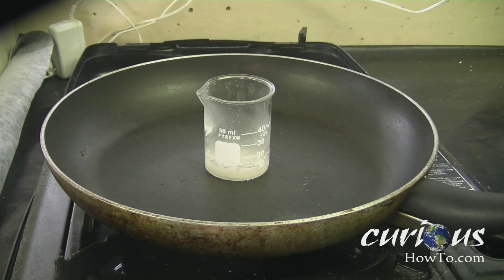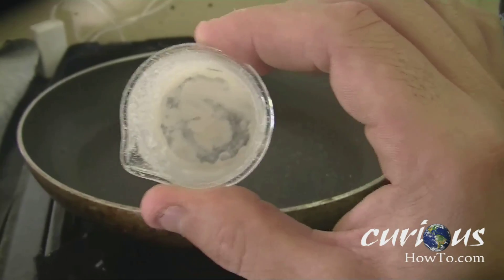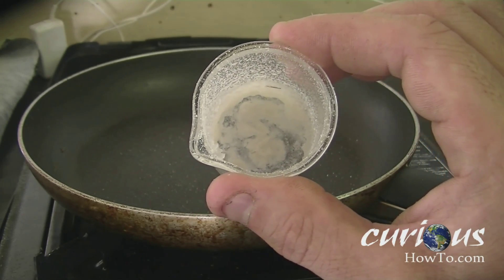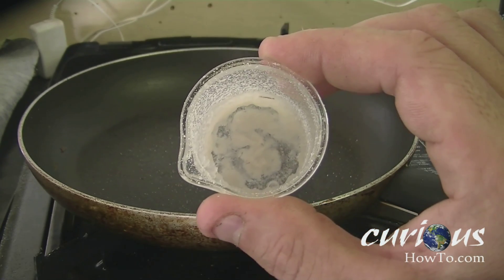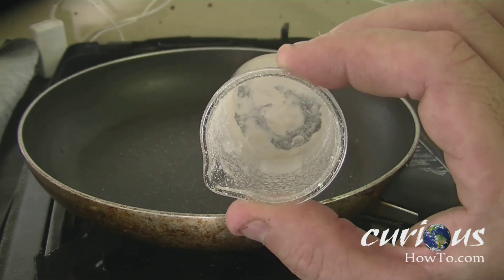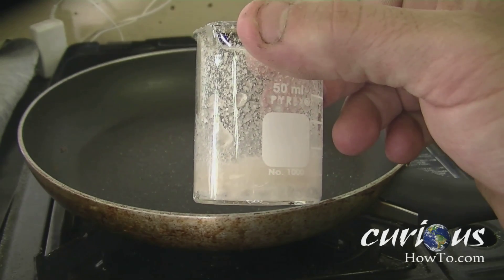We're going to want to heat up the solution again and evaporate the rest of the water. Keep heating the solution until most of the water has evaporated and no more steam is ejected from the beaker. Now that the solution has cooled and most of the water is evaporated, we are left with boric acid.